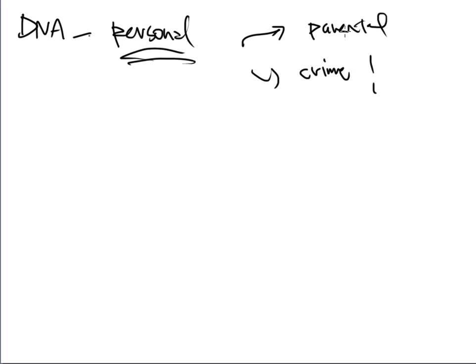All right. So the other lab experiment that we've done is a crime scene investigation, where this is going to be a perfect match. What we were looking for was a suspect, or one of the suspects, perfectly matching the DNA sample that was obtained from a crime scene. And we know that maybe it puts them at the presence of the crime scene itself. That doesn't mean that they've done the crime, but it at least puts them a little bit closer to the crime or the suspect or the victim or whatever the case is.